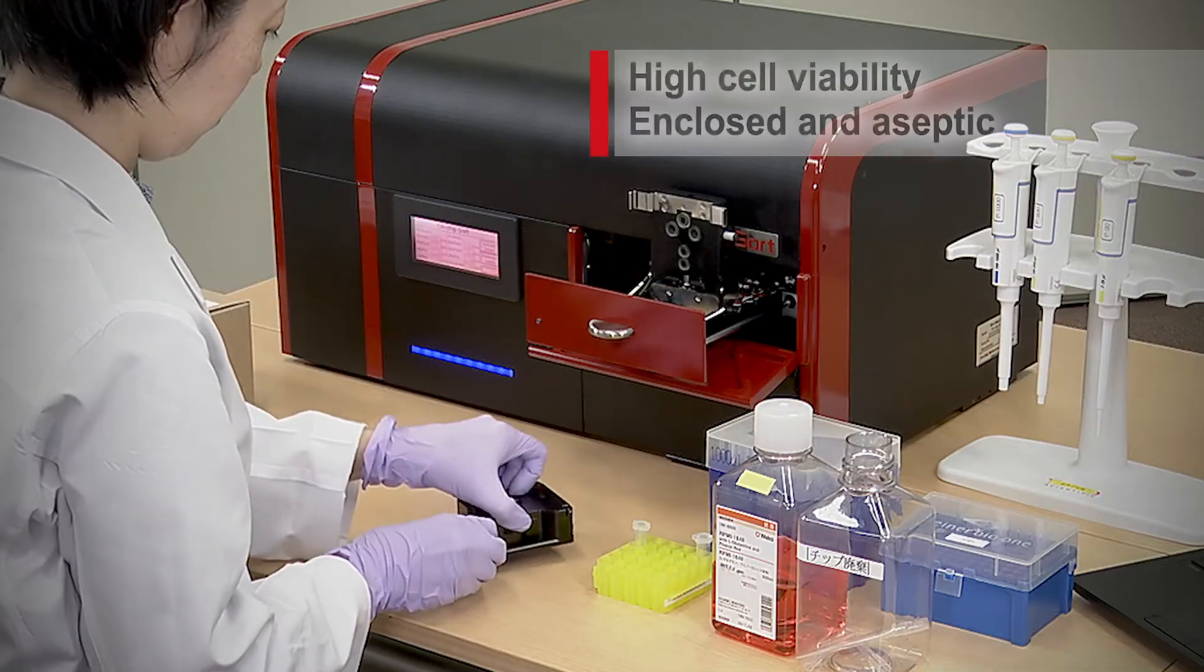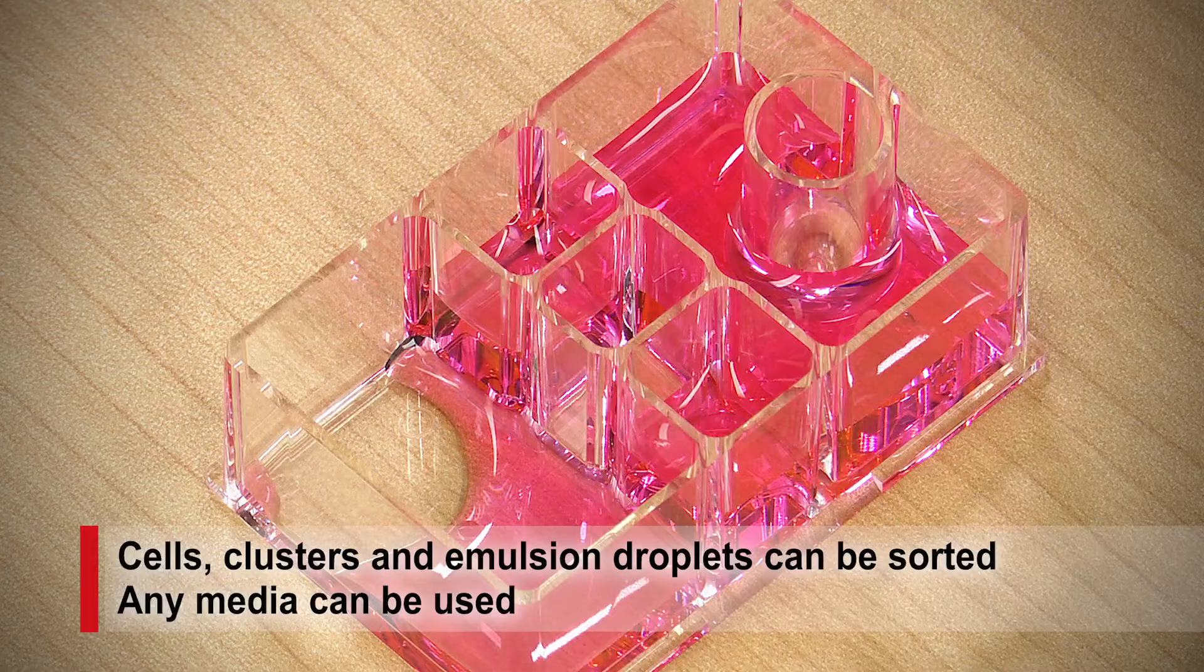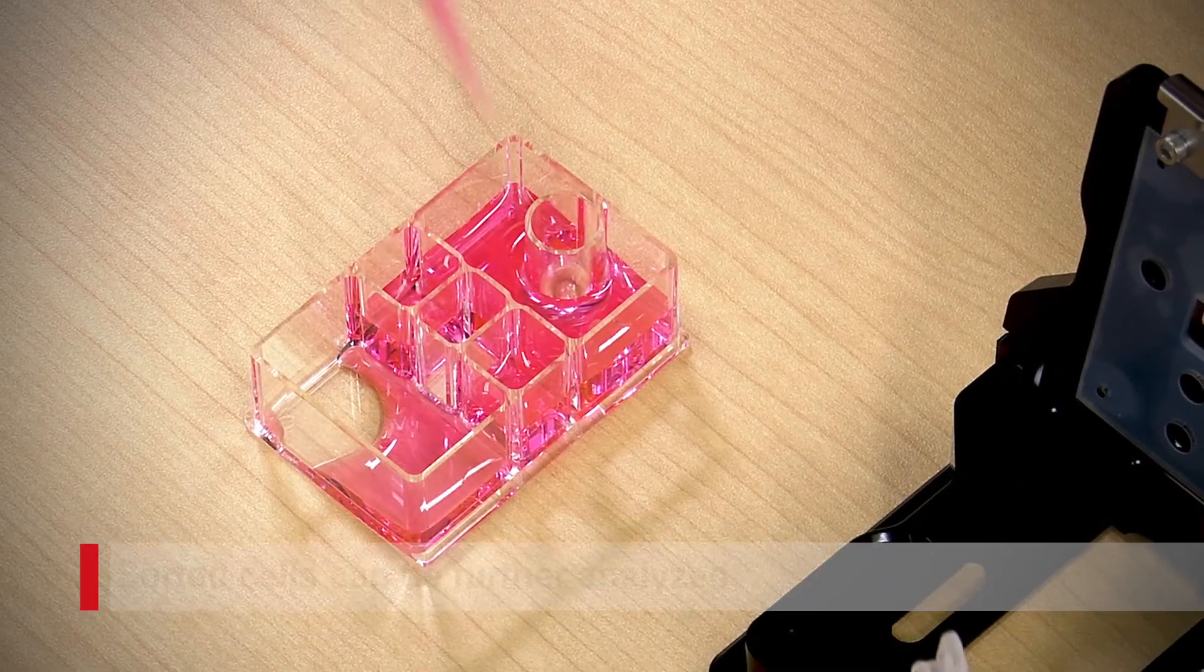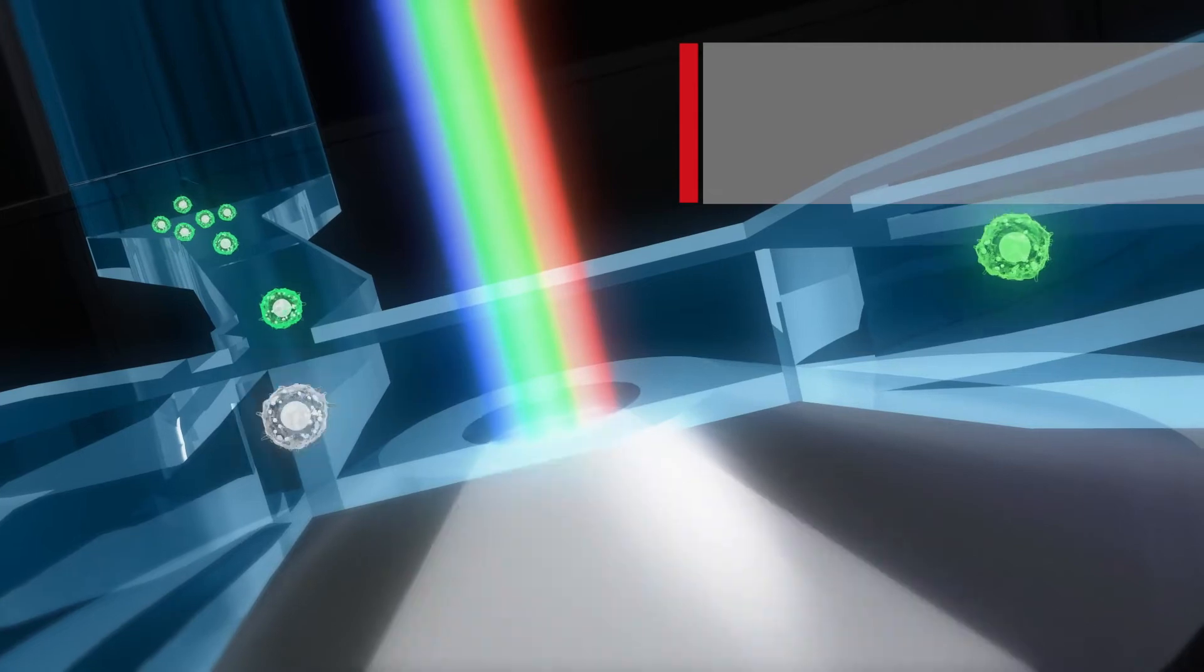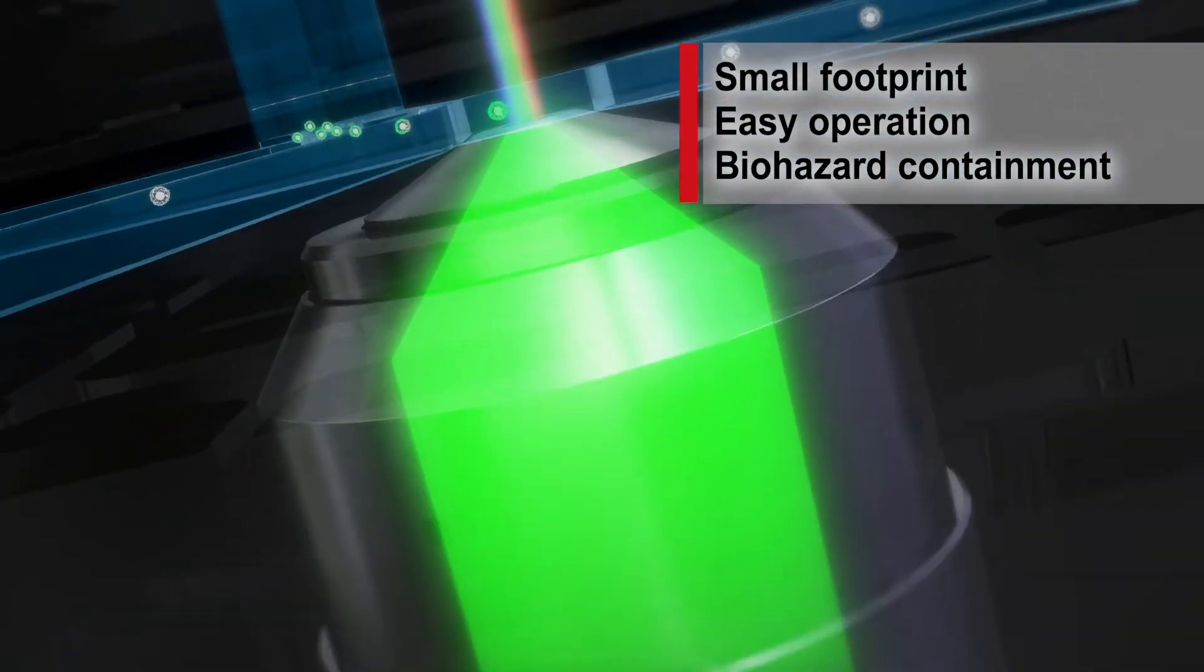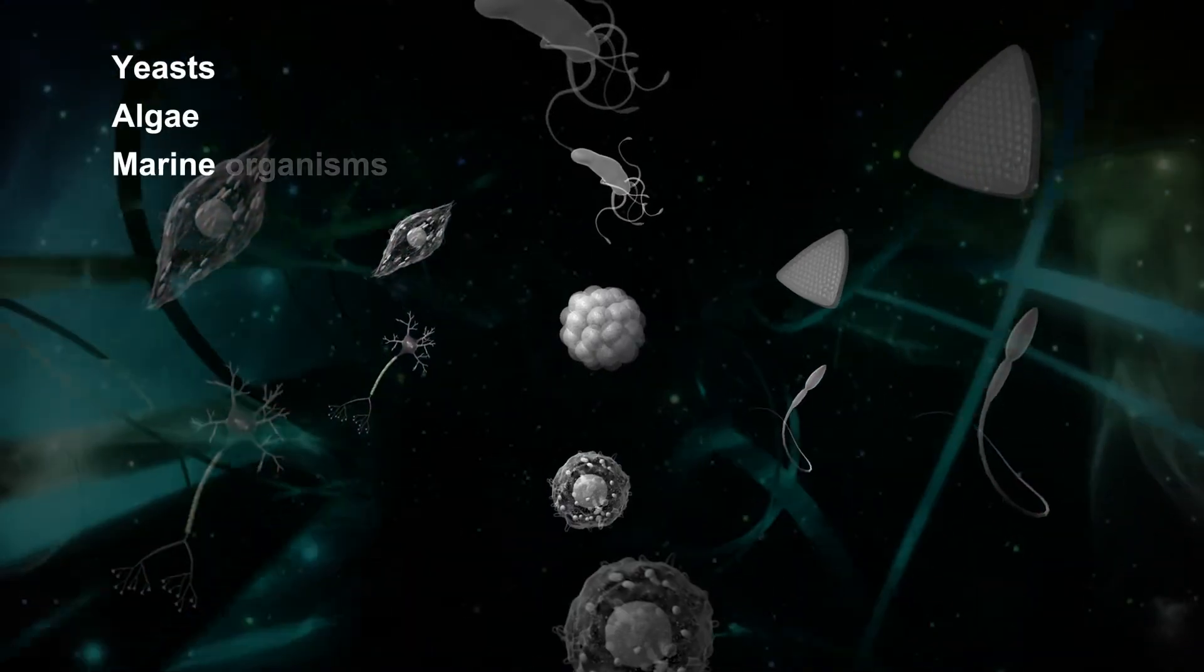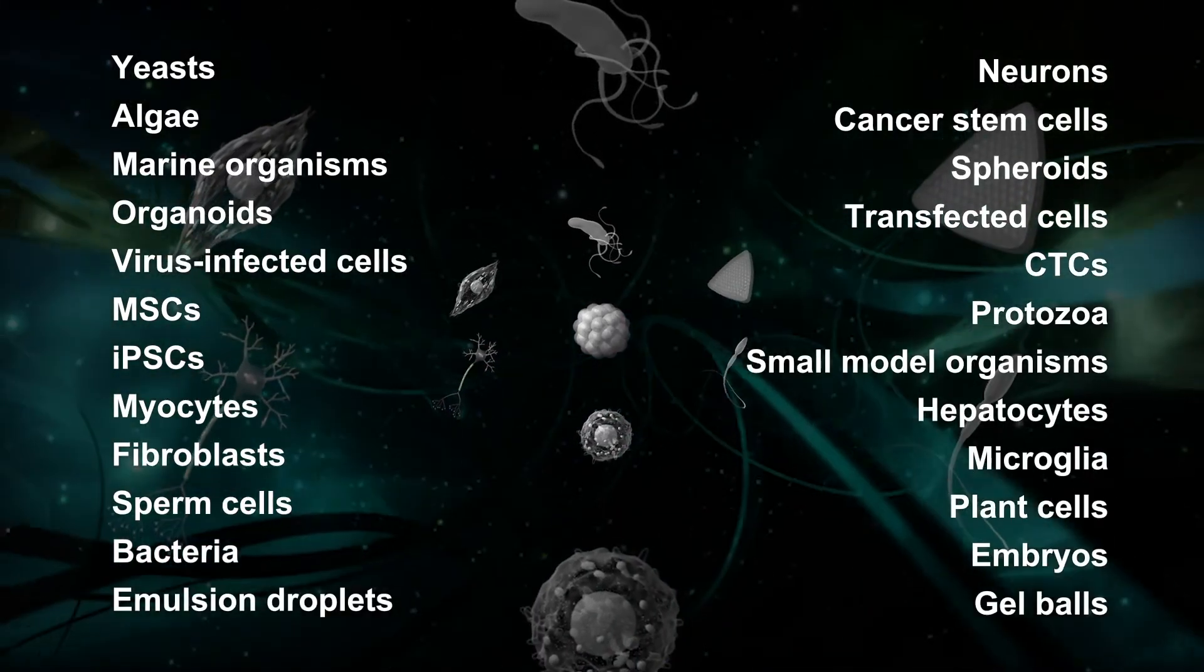Damage-free, aseptic, and contamination-free cells, cell clusters, and water-in-oil emulsion droplets can be sorted. Re-analysis and re-sorting of samples are possible. On-chip Sort is compact, easy to use, and compatible with biohazardous samples. You can sort cells that are particularly important for the future without having to worry about damage at all.